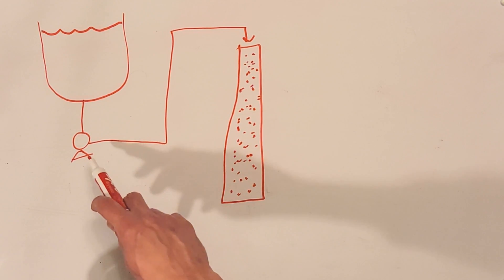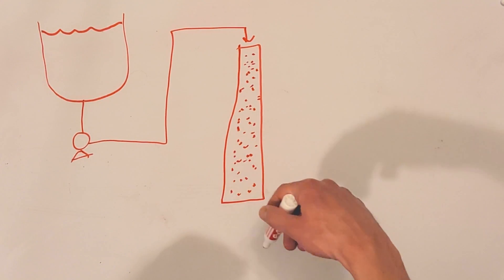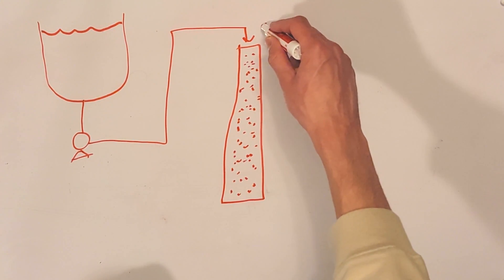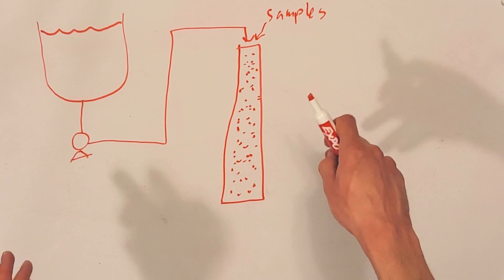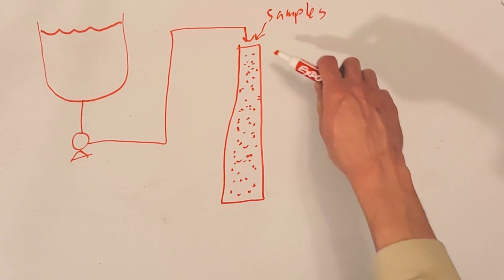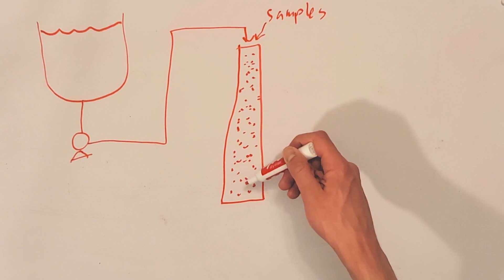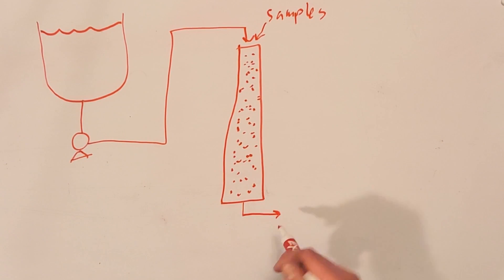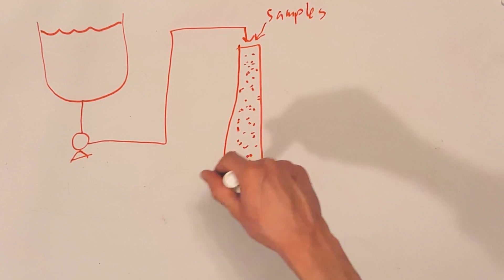With my LPLC system, I was planning on the pump to just be a peristaltic pump. The column is filled with tiny particles that bind preferentially to whatever compound you're passing through. Let's take CBD and THC as an example. Just because of the difference in the structure of the molecules and the functional groups on the molecules, CBD or THC may stick more or less strongly to the column. So let's say CBD doesn't like this material as much as THC — CBD is going to move through faster and elute first, while THC will take a little more time and elute second.